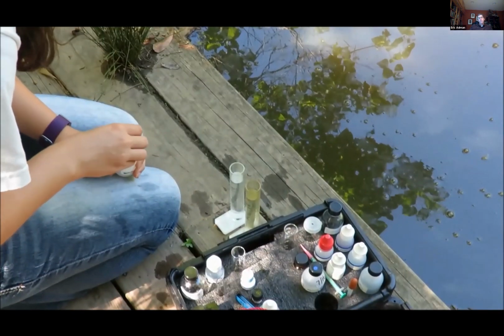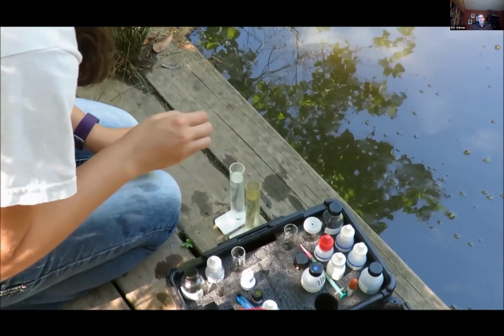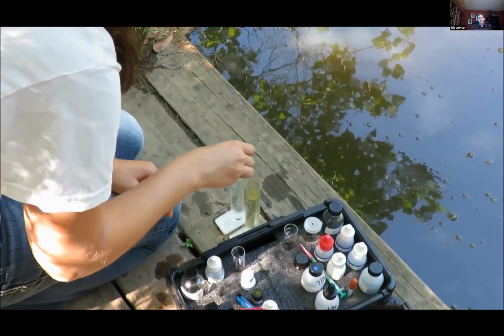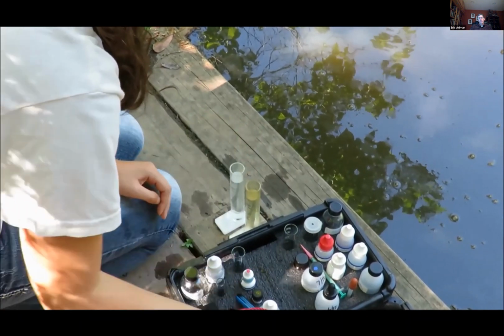If the control dot is less fuzzy than the sample, add half a milliliter of turbidity reagent at a time to the control column. Between each addition, stir the contents of both columns and vigorously shake the turbidity reagent bottle. You will need to know how many additions you add to the control column, so don't forget to count.